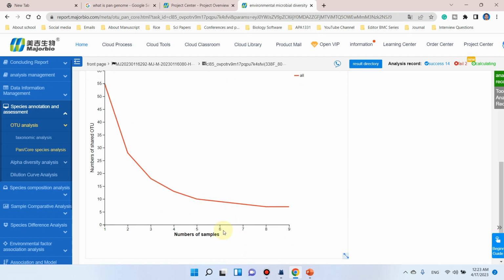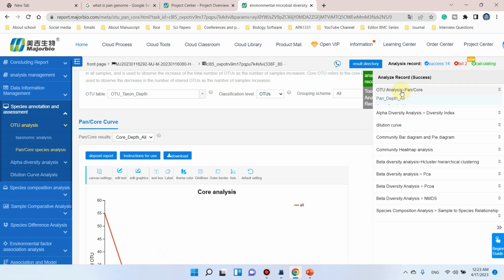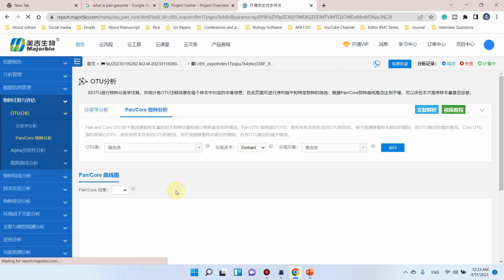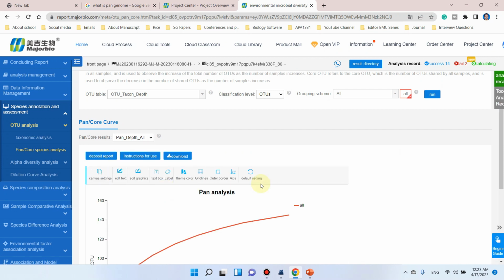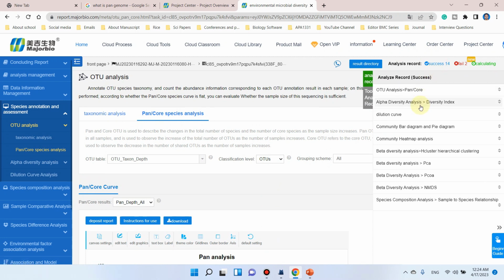And if we look at the control positive, you can see the number of shared or common OTU is further decreased. And if we look further at the management group, the overall shared diversity or shared strains between these samples is further decreased. So it means our first analysis of OTU shows that in the pan genome analysis, our first control group has the highest pan genome, but it has the lowest core genome.